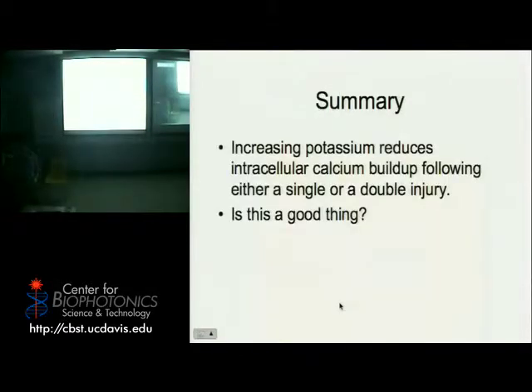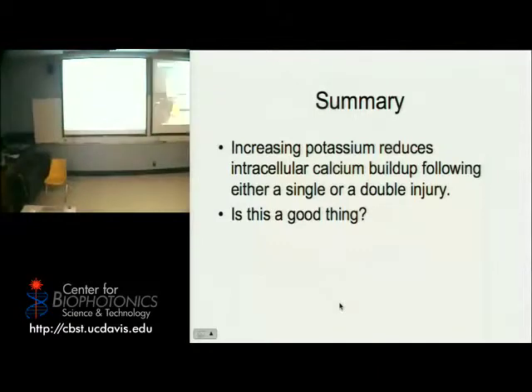You didn't pop a membrane. What do you mean, pop a membrane? So that one where, after the second injury, suddenly you had a couple of cells go from bright to dark. They die. Well, when did they die in terms of fluorescence? The membrane just deteriorated and there's nothing to hold the dye in. It diffuses away. I mean, right, the buffer is in excess. Oh yeah, absolutely. Those membranes popped. But you notice they didn't pop right away on the injury. They pop after the injury. So yeah, the cells die, the membrane starts to disintegrate, and there's an excess of buffer.